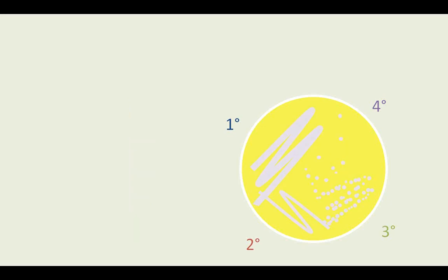The next day, your plate should look something like this. Lots of growth on the primary streak, with less and less growth on each subsequent streak. If everything went right, you'll have individual colonies somewhere on the plate.